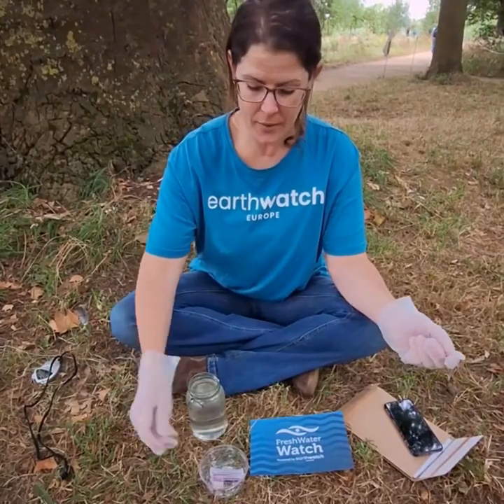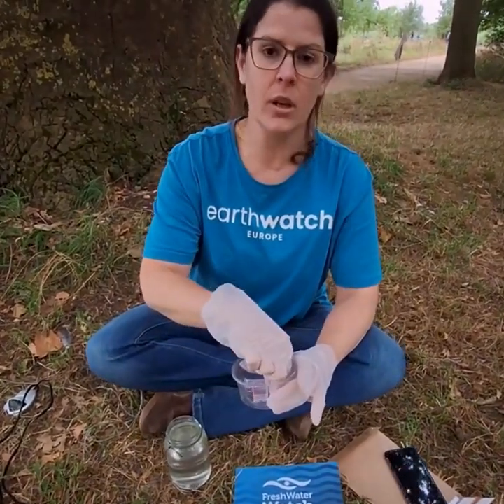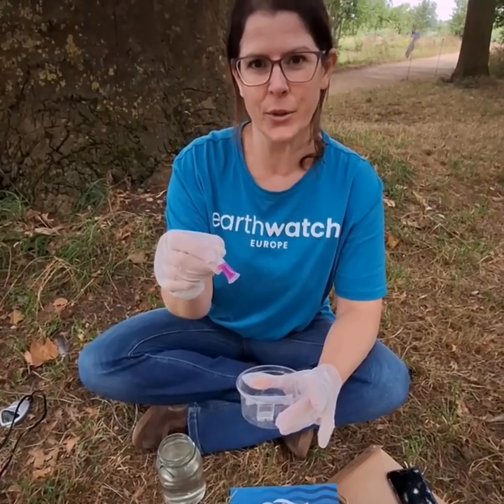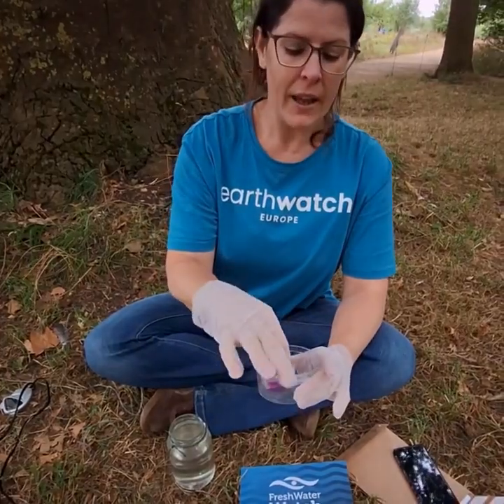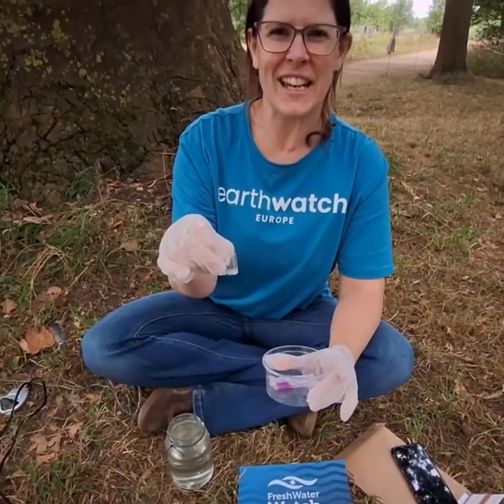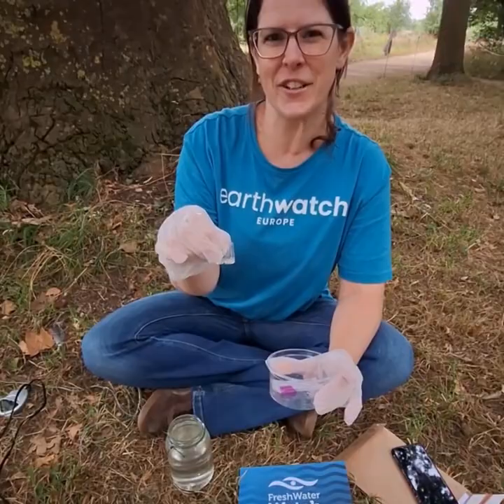Now we're done. Please take home your tubes and the pins to be recycled. The gloves are compostable, as is the cup — keep it just in case you want to sign up to the next Great UK Water Blitz.